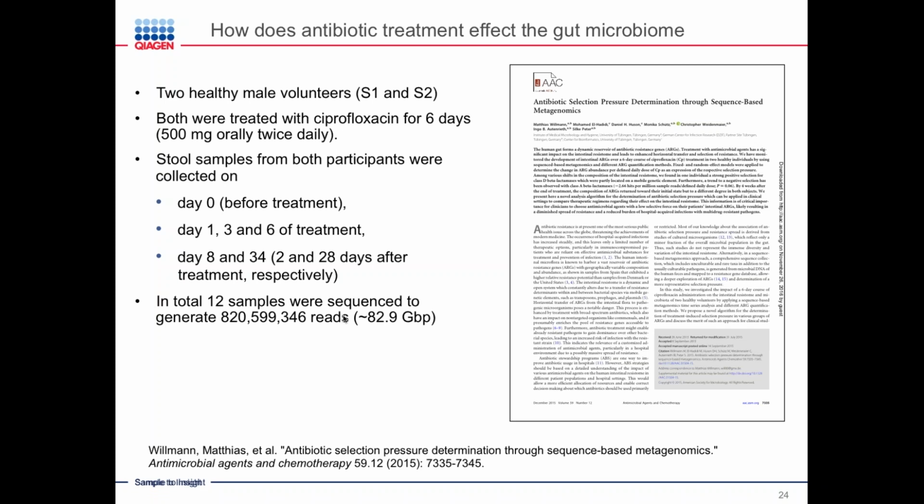That was on benchmark datasets that were synthetic in some ways at least. But does it also work on real data? So I set out to test it on a manageable real dataset.